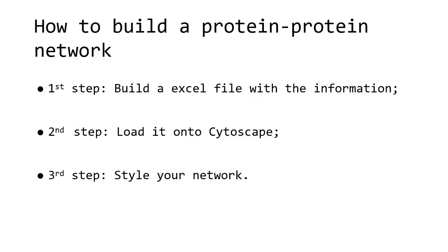Building protein-protein networks or gene networks is not always so straightforward in Cytoscape, so I'll show you here how to do it in three simple steps. The first step is to build an Excel file with information about your genes or proteins, load it onto Cytoscape, and style your network.